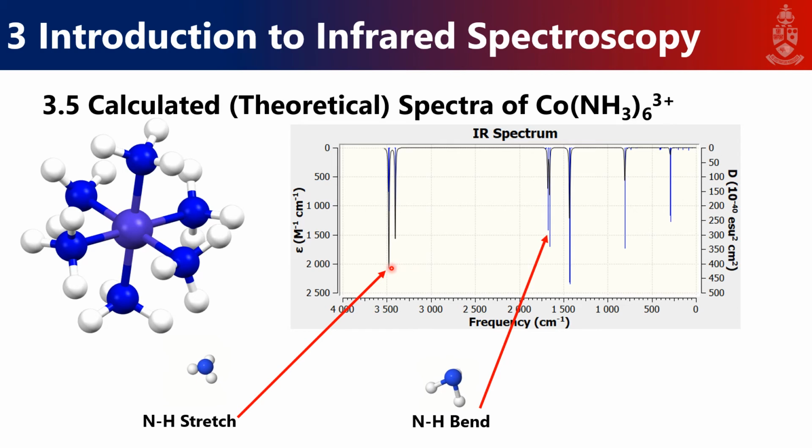And we can see that there are peaks, these little doublets. You might ask, why are they doublets? I'll give you 2 seconds to theorize by yourself. Why are there two different peaks for the same motion? I think because there are different molecules here, so they either move all together or they might not, and that gives rise to something that is just slightly different, right? Okay, anyway, then we get these two characteristic peaks. You see there are different peaks here that are also present. I'm not quite sure what they are. They might be cobalt nitrogen peaks.